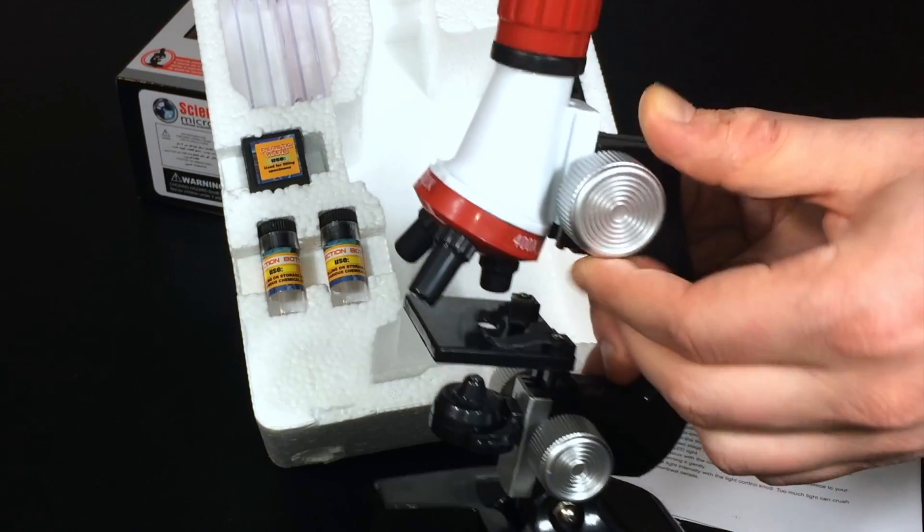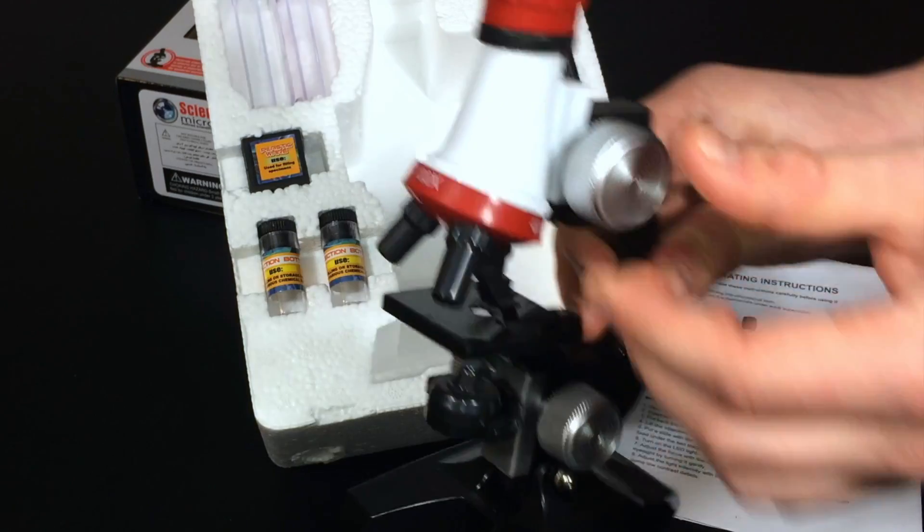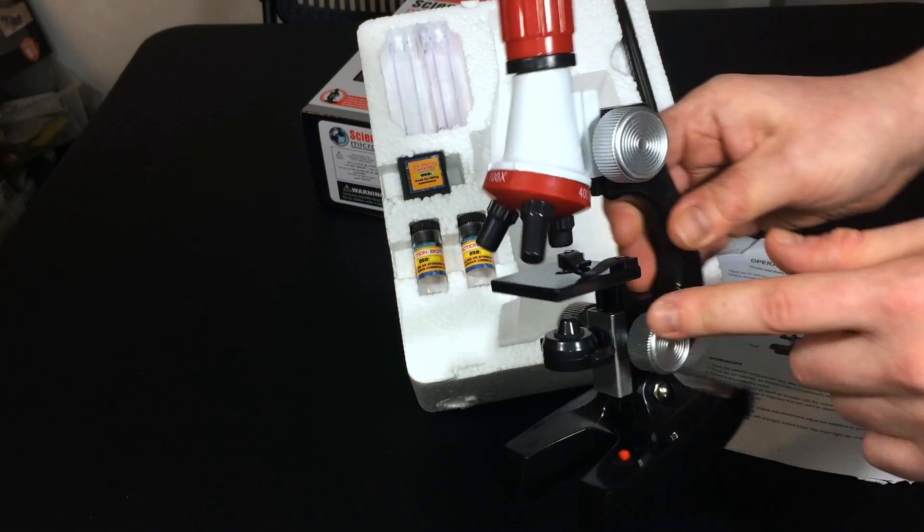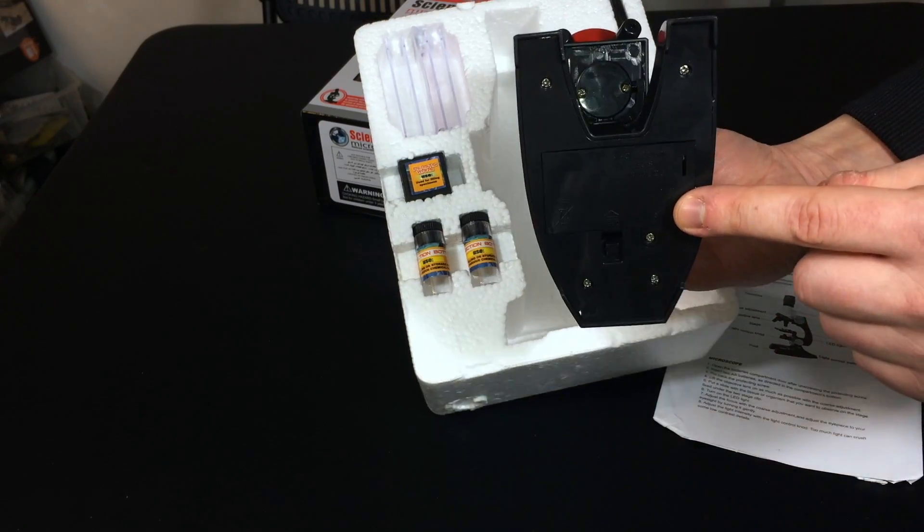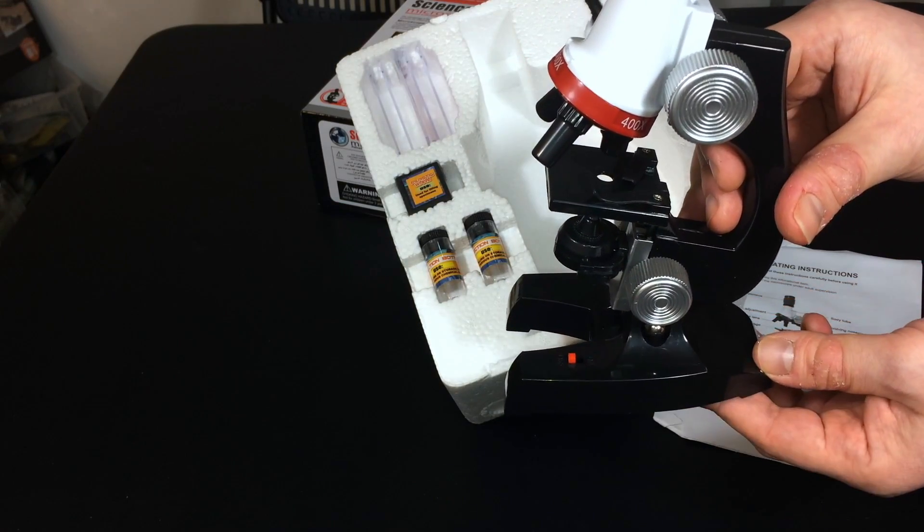What happens is you have the actual eyepiece itself is 10 times and then you multiply by 120 to get the 1200. So in reality, to get to 100 magnification, you would have a 10 times and a 10 times lens. That's how you would get the 100 times magnification. Very typical. As you could tell, the adjustment is fairly fast. I would like it to be a little bit smoother. But that's what it is. So let me put some batteries in this bad boy and then we're going to see if this light actually works. Batteries go right here on the bottom. I'm going to do this off camera, guys, but trust me. It just uses two AA's and we'll give it a go.